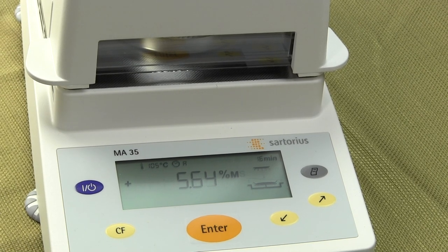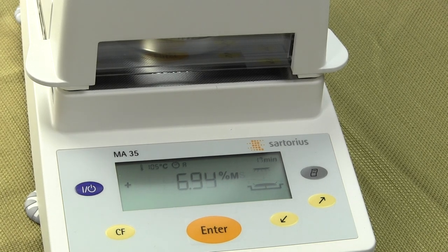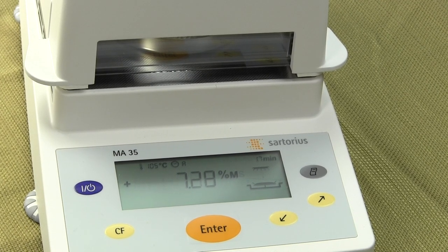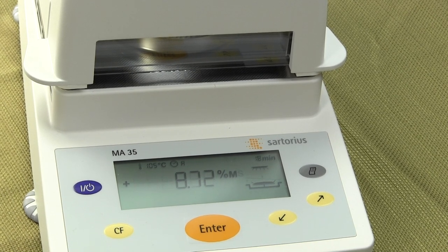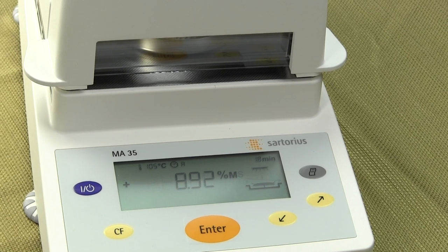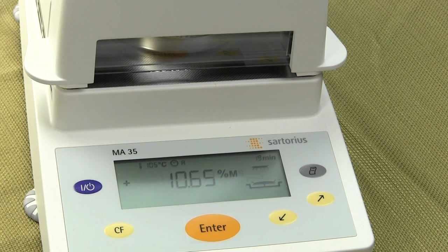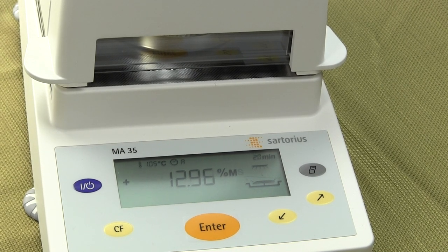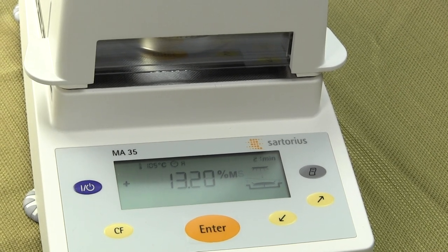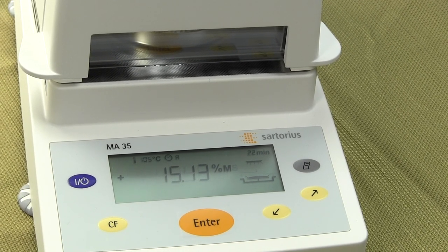The heating is achieved by the two metal tubular heating elements, which provide 360 watts of power. The heating element is also called a dark radiator by some people. It's extremely rugged and durable. Compared to infrared halogen, the halogen bulbs burn out. Halogen does come to temperature quicker, but you also overshoot, which can burn the item you're testing.